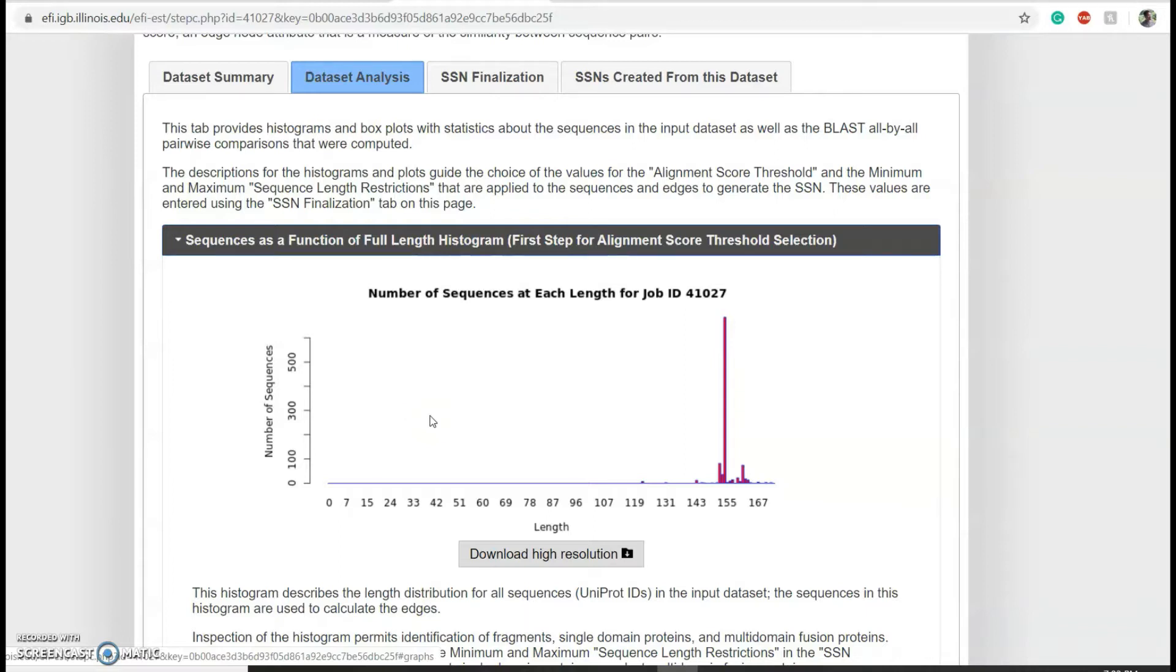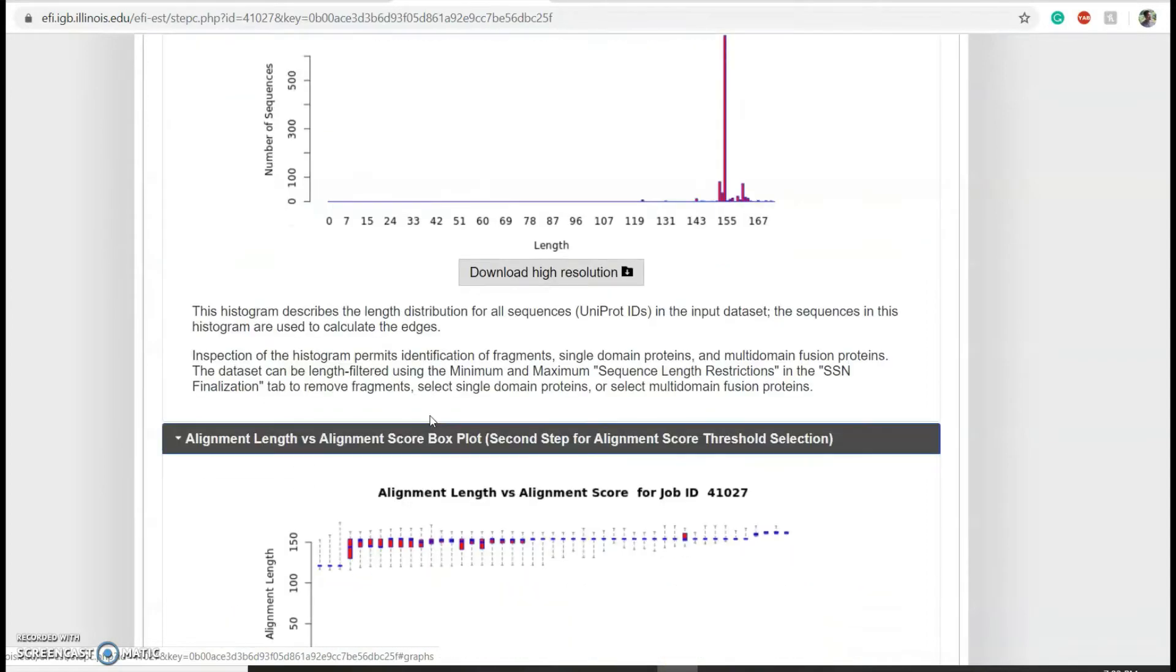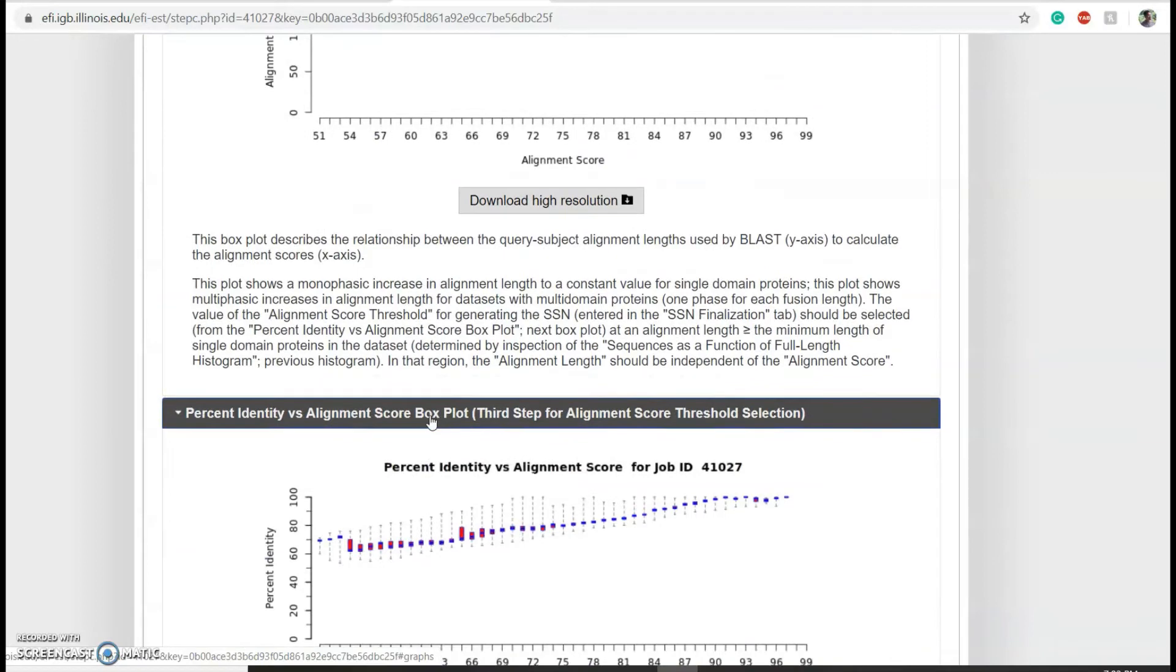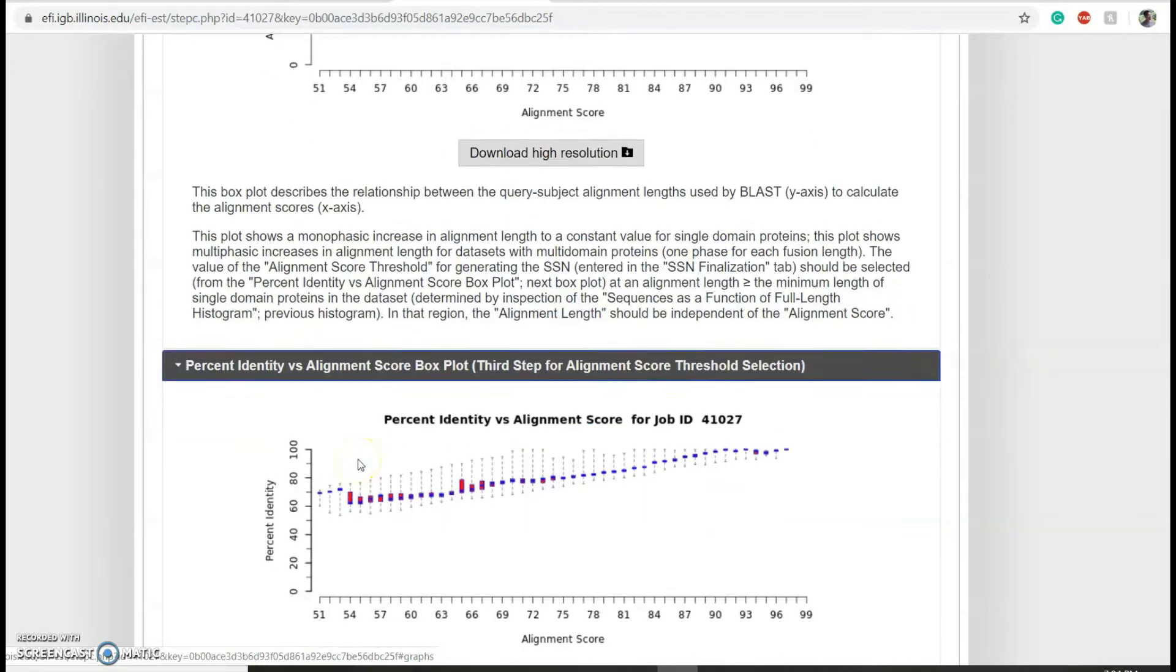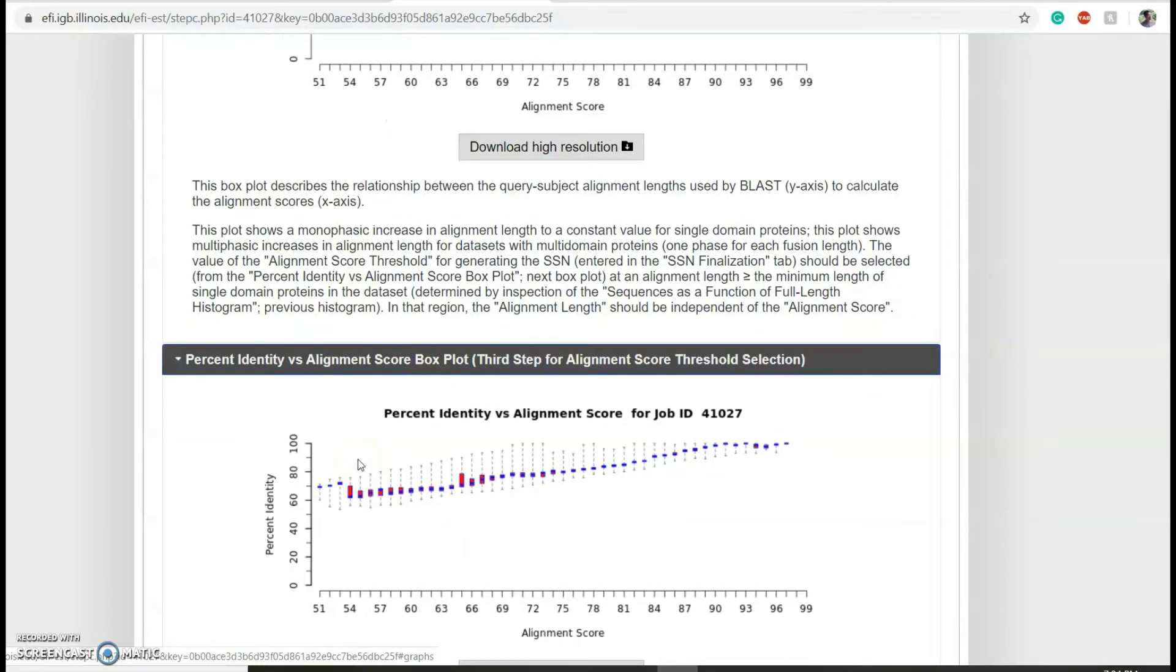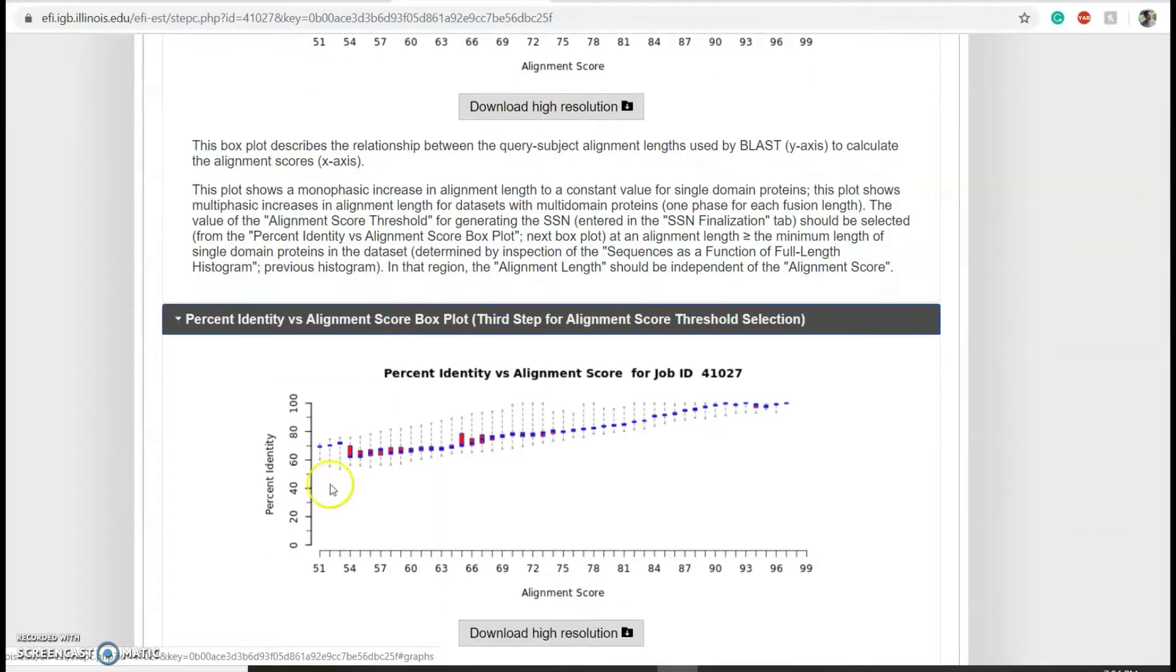Before proceeding, it is important at this point to identify the alignment score to use to generate your sequence similarity network. To identify this alignment score, you can scroll down to the percent identity versus alignment score box plot. As a starting point, EFI recommends using an alignment score that corresponds to 35 percent sequence identity, so in our case around here.